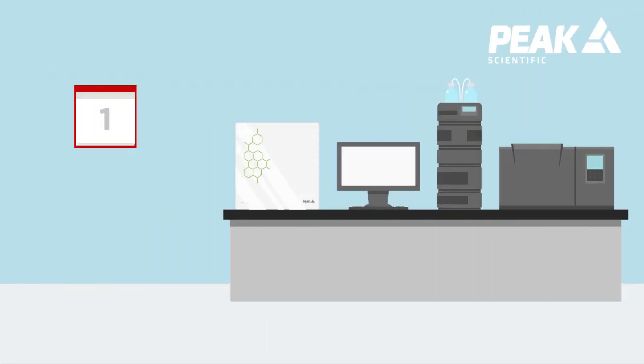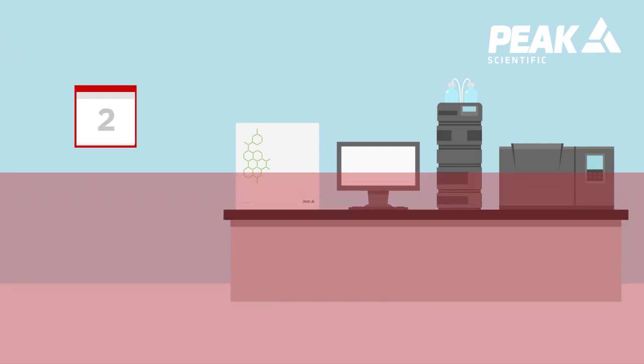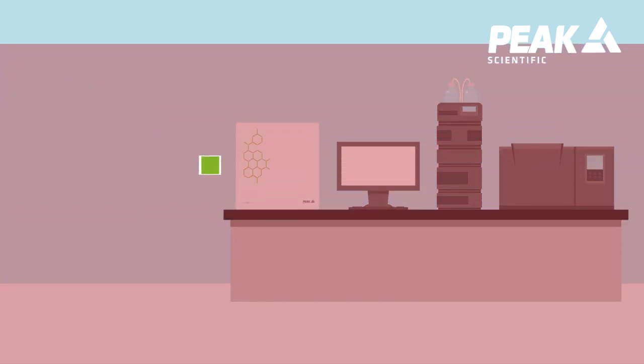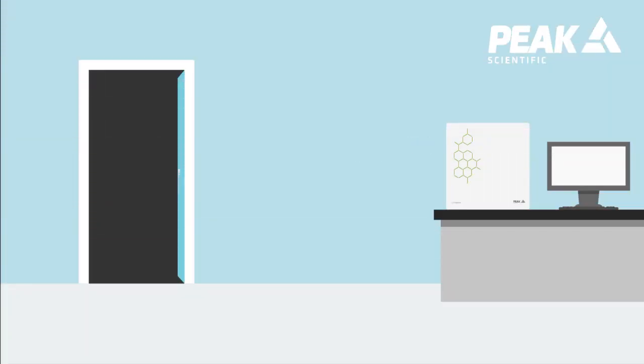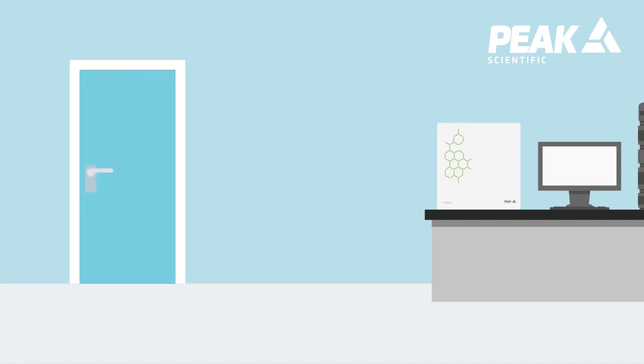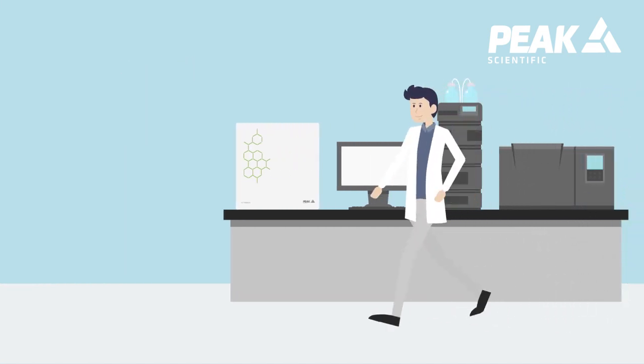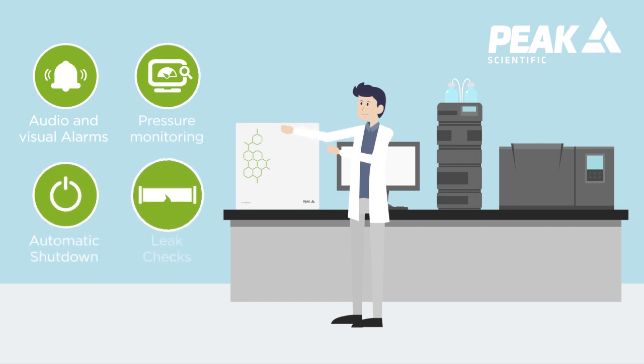On the other hand with the Peak Precision hydrogen generator it would take 3 days to reach LEL because the hydrogen capacity is only 500 cc per minute. This is also assuming that no hydrogen would escape the lab in those 3 days. Though the likelihood of this happening is extremely low due to the built-in safety features of every Peak gas generator.